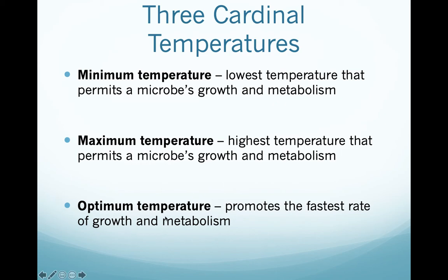The temperature that bacteria like, that makes them the happiest, where their cells function, where the bacteria is growing and dividing as happily, as quickly, and as strongly as it can. Whatever temperature that is, it is known as the optimum growth temperature. So if you want to grow bacteria in a lab, you need to figure out what their optimum temperature is and then set your incubator at that particular temperature.